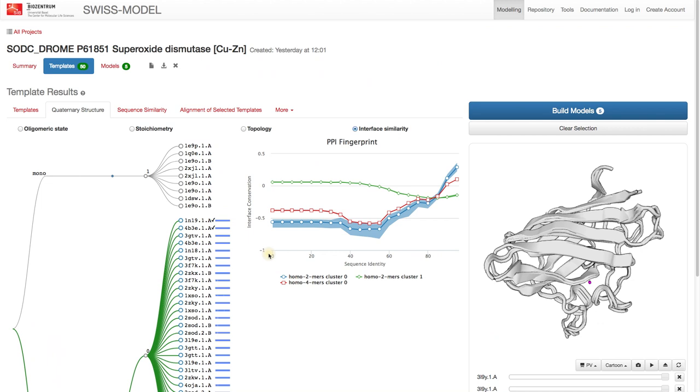A value of interface conservation below zero indicates that interface residues are less prone to mutate compared to surface residues. The estimate is calculated from a multiple sequence alignment using different identity cutoffs.